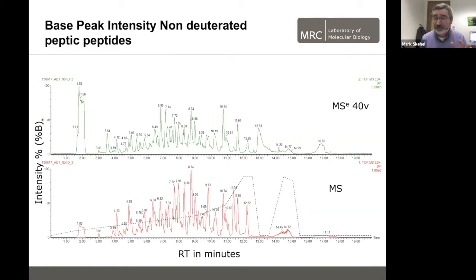So what you do is you're spraying your peptides into the mass spec, and you collect data for a second, and then you switch in that quadrupole and you fragment everything. You use some energy and fragment everything that's going in there for a second, and then back and collect MS, another second, fragment everything. And then you align based on retention time. Okay, so you get some accurate mass retention time. So you align the fragments with the precursors.